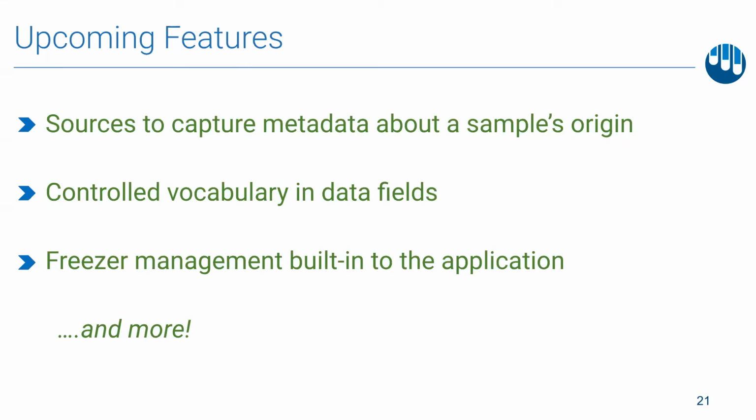There are lots more features and functionality to come, and our team is really excited to learn from you and hear what's important to your teams. As you saw in the beginning, LabKey prefers to listen to scientists' needs rather than dictate them, and we're eager to continue growing this product with partnership and feedback from you.